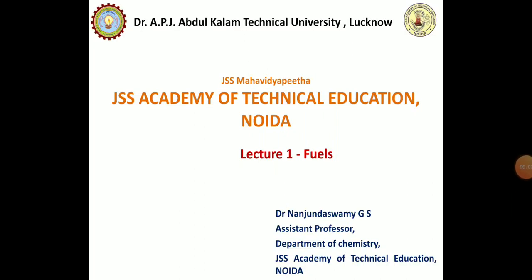Hello everyone. In this video lecture I am going to discuss the topic of fuels. The contents of this video: general introduction of fuels, classification, calorific value, determination of calorific value using a bomb calorimeter, and theoretical determination of calorific value using Dulong's formula, with one example.